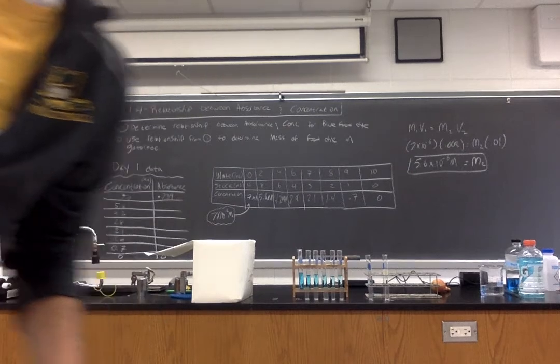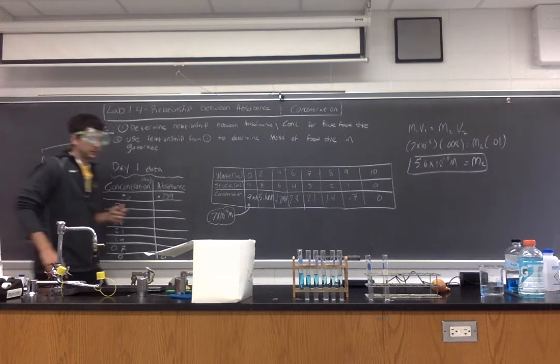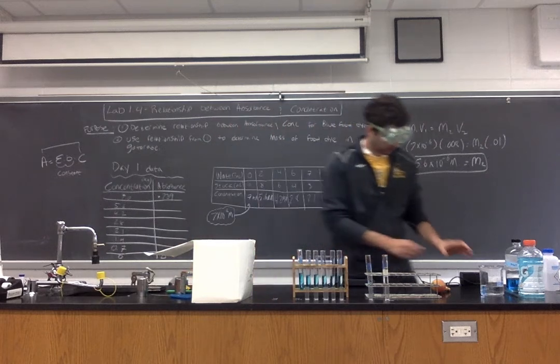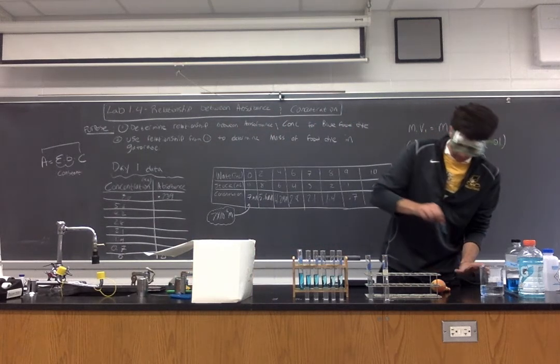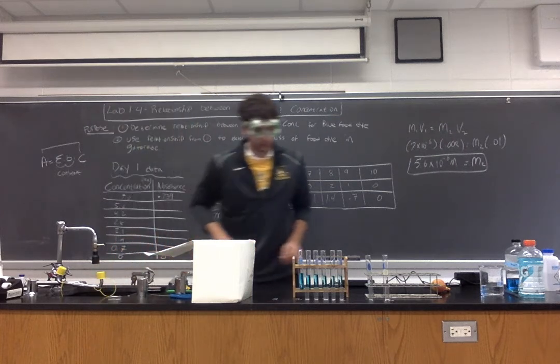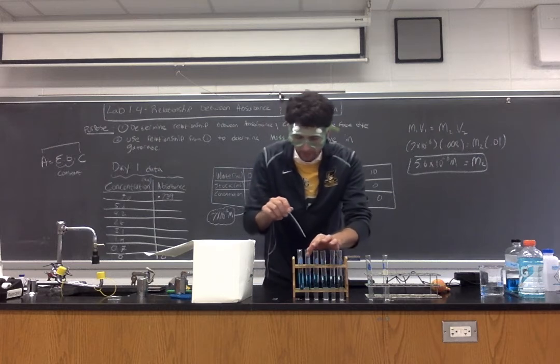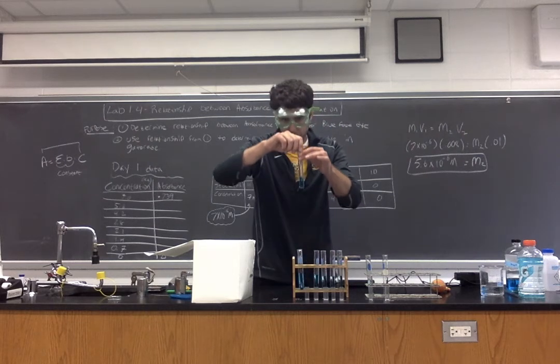So now I'm going to do the same thing with the remainder of the solutions. Now, make a prediction as the concentration goes down.